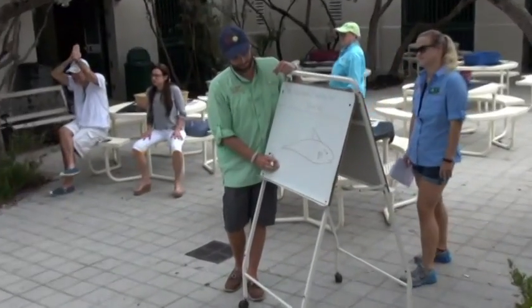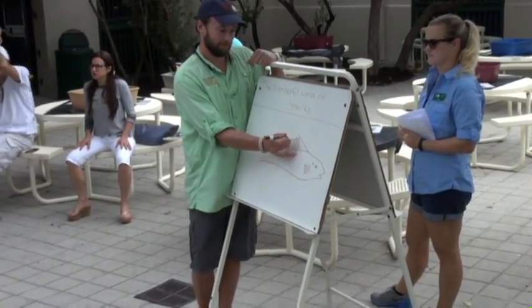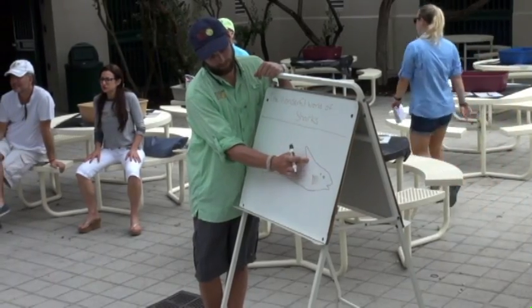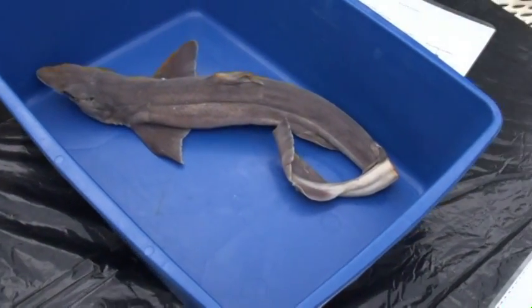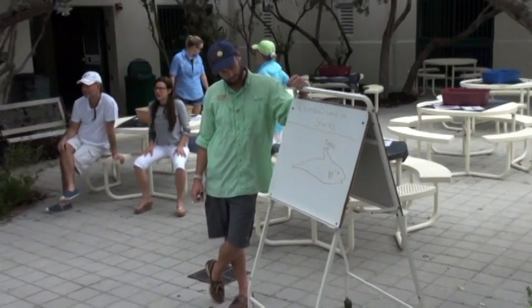Excellent. This guy doesn't really do a lot of the movement for swimming, but what it does instead is it actually helps with keeping these guys straight and upright so they can remain as hydrodynamic and very efficient, meaning that they're able to get a lot of food and they're able to move through the water really, really easily. So this is that dorsal fin, helps them keep upright. If they didn't have that dorsal fin, they would kind of be swimming in circles.